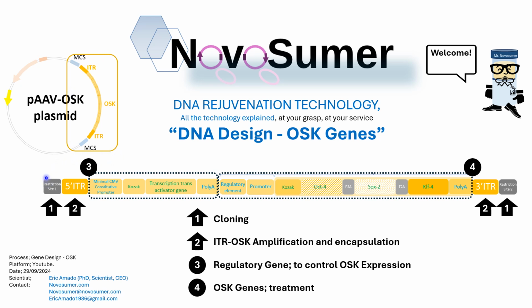Okay, the OS genes are structured kind of in layers. And the first layer that wraps the whole thing are the restriction site 1 and the restriction site 2. You see here, I have marked them with the label number 1, here and here.